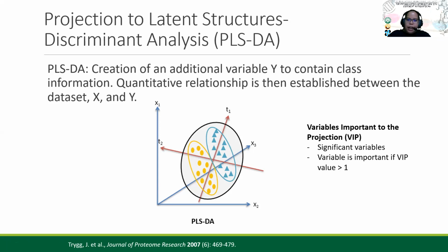But nevertheless, this is useful. As you can see, pwede mo siyang separate. But again, we have to be careful kasi when you make use of class information, it can be prone to overfitting, and therefore, you need to ensure that it is validated subsequently.